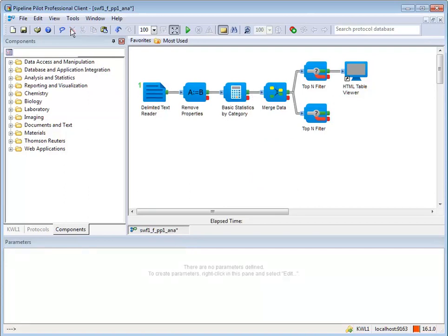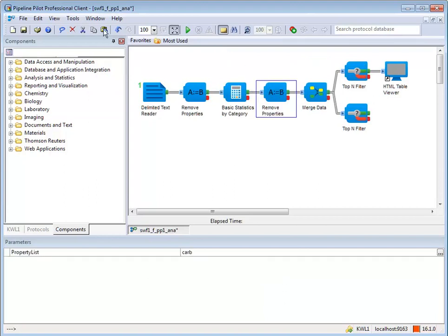If a single pipe between two components is selected, the component will be pasted between the two existing components.